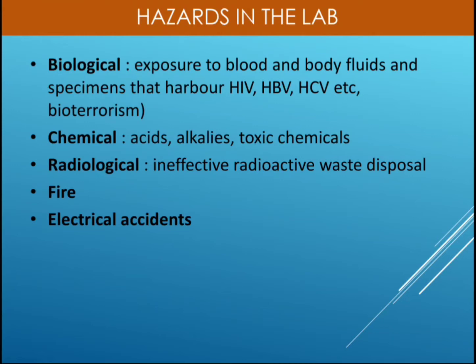Then fire. Fire can be an outcome of short circuits and various other reasons, and where alcohol is present, it can catch fire. Those hazards should be taken into consideration. Then electrical accidents, meaning electrical shocks to the personnel, should be avoided.